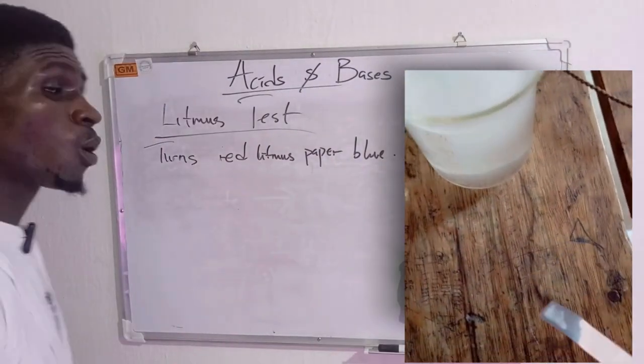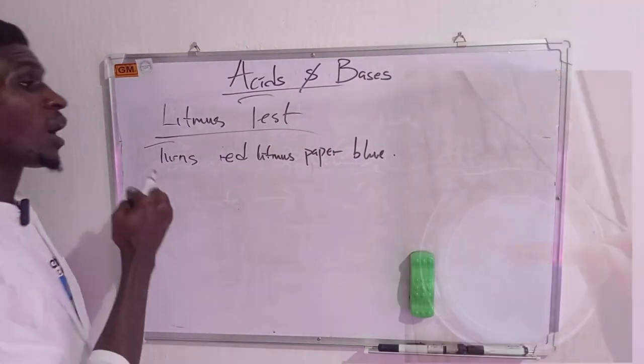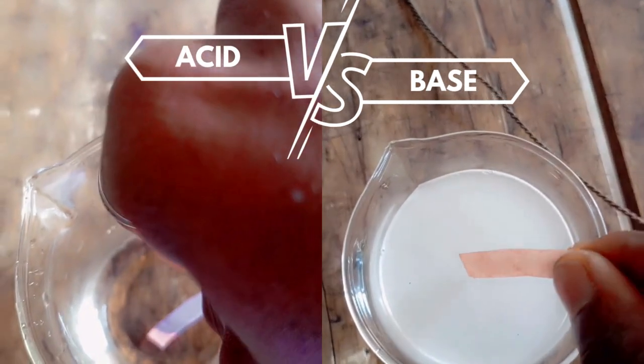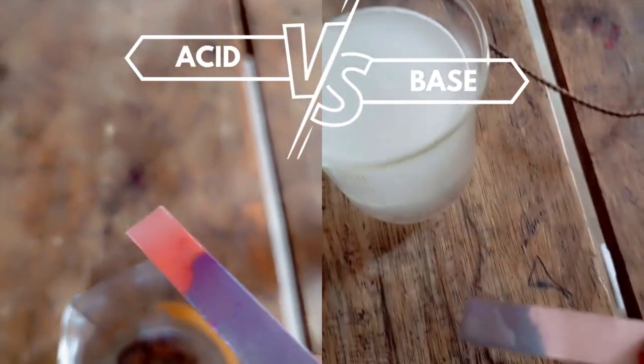This is the opposite of what we know for tests for acid using litmus paper. So while acid turns blue litmus paper red, bases turn red litmus paper blue.